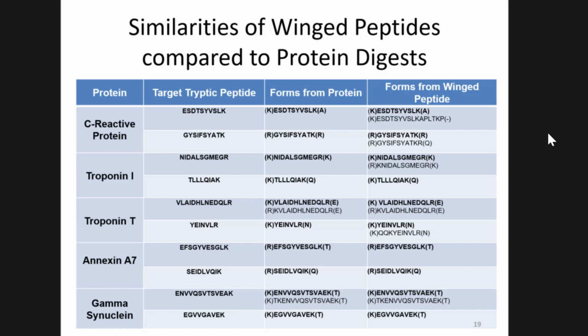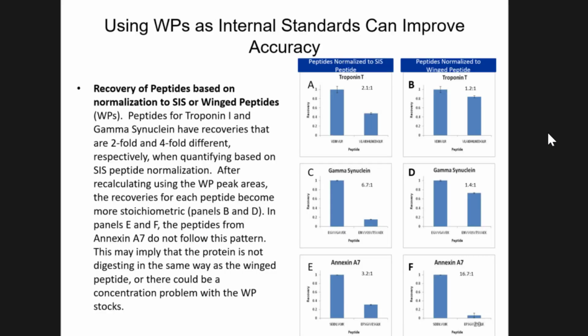Also, the idea was whatever you see from the light form that's miscleaved, you're hoping to see in the winged form miscleaved. For the most part, we saw some extras. In some cases, we saw agreements, but there were differences where we're like, huh, what's really going on? So this is all in here so that you can contemplate it later. It just adds all the details.